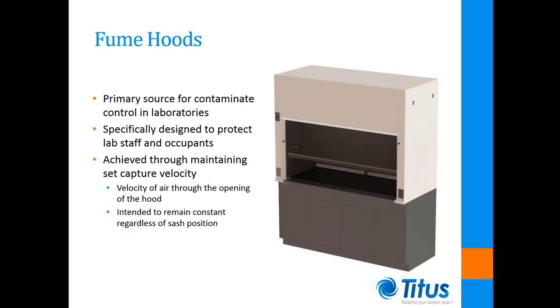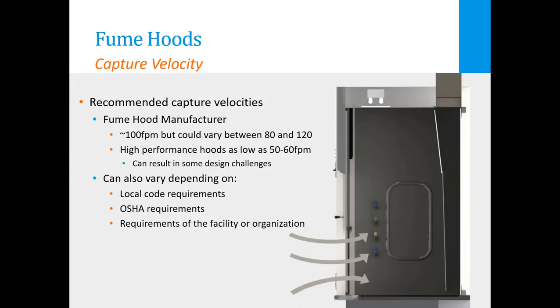The primary source of contaminant control in labs are fume hoods. These are devices specifically designed to provide protection to the lab staff and occupants from the fumes, vapors, and particles generated by the operations being performed within the lab. Fume hoods keep contaminants contained using air that is being pulled through the face of the hood. A common criteria established to contain the contaminants is capture velocity — the average velocity across the main opening of the hood — which is intended to remain constant even as the sash position is adjusted. Maintaining this velocity is crucial to maintain effective contaminant control.